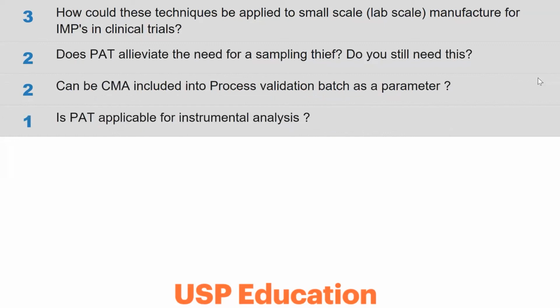Does PAT alleviate the need for a sampling thief? You still need this. Hopefully not. A sampling thief, of course, is just a way to take samples from the top, middle, and end of a blend, right?